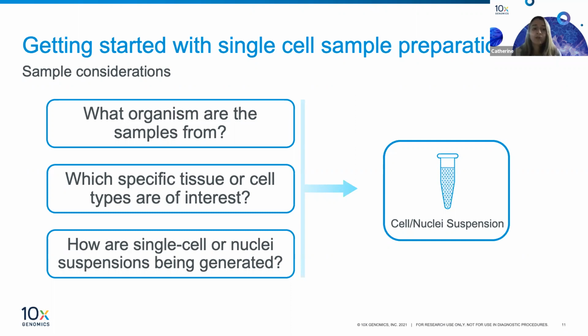And how are you going to generate these single cell or nuclei suspensions? Have you already got a protocol that you're using in your lab? Or are you starting from scratch and needing to figure out what protocols there are that are going to be suitable for single cell assays? And I think the goal of asking yourself these questions is evaluating where your starting point is and the gaps in your knowledge that you need to fill before you can start to prepare your sample in a sufficient way for the 10x assay.